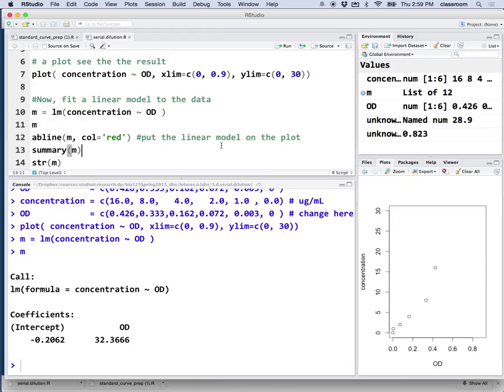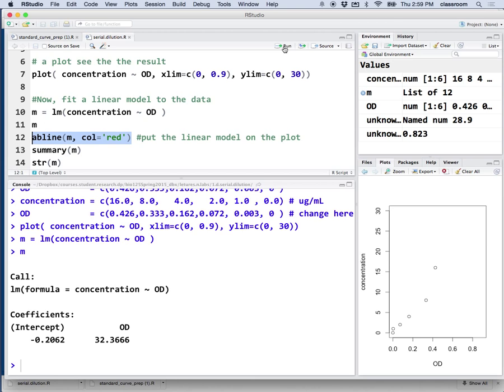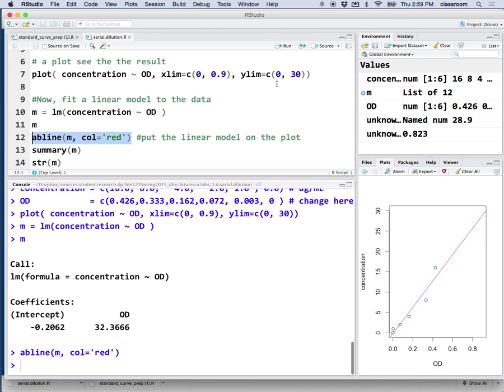We have not put the linear line on the plot. And the way to put it on the plot is called AB line, abline. I'm going to highlight this line, and then click run there. That line is magically put on the plot.